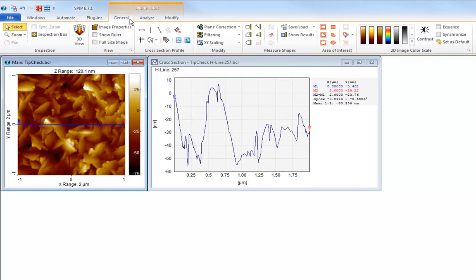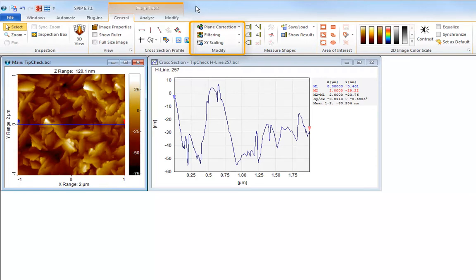To speed up work a group of the most frequently used modified tools has been placed on the general tab. This reduces the amount of switching between ribbon tabs significantly.